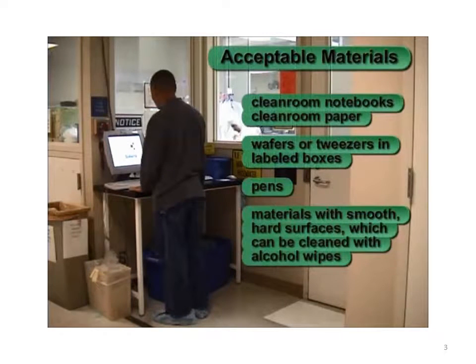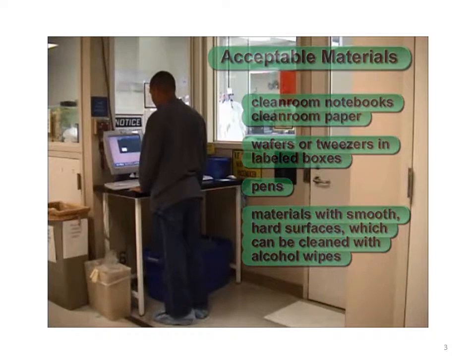The following materials are acceptable in the clean room: clean room notebooks and clean room paper, wafers, tweezers and labeled boxes, ballpoint pens, and materials with smooth hard surfaces which can be cleaned with alcohol wipes.